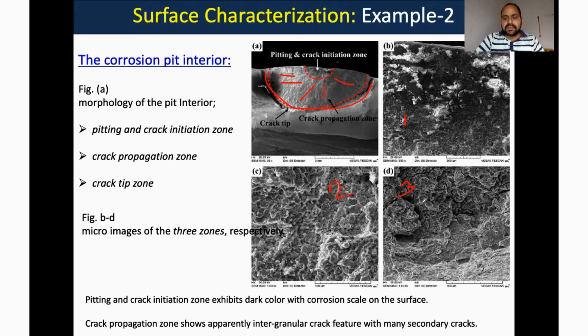So that was the big crack, and there are also other cracks. That is basically the cause of such a big crack forming in the system. These kinds of information can be extracted by doing the SEM analysis.